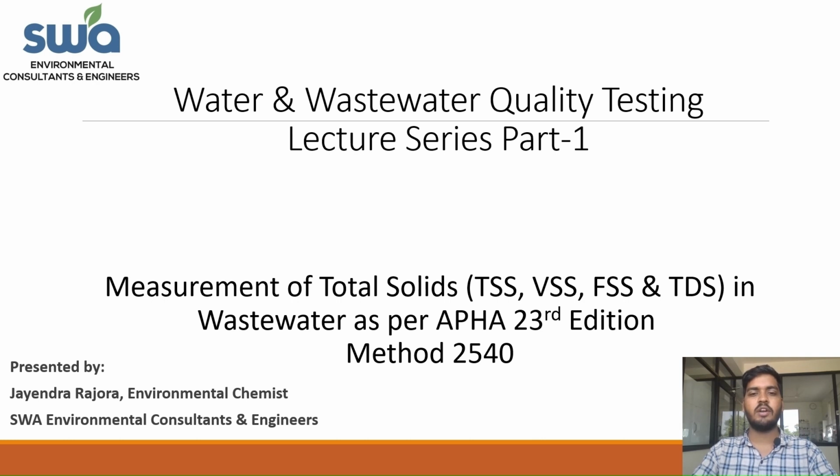This is Water and Wastewater Quality Testing Lecture Series Part 1. In this video, we are going to learn about the measurement of total solids in the water sample. Total solids contain suspended solids, dissolved solids, fixed solids and volatile solids as per APHA 23rd edition method 2540. So now let's start the video.